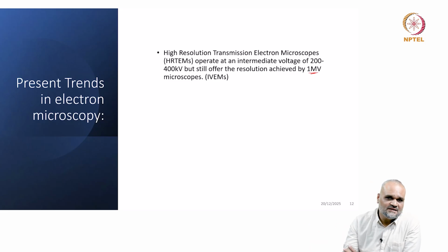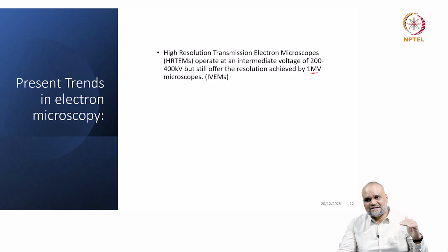So from the 1980s to 1995 or 2000s, I think around 1998 is when the first trials on aberration correctors were successful, by Harald Rose, Maximilian Haider and Knut Urban. This was done at the Forschungszentrum Jülich, breaking that 1 angstrom resolution barrier and getting aberration corrected microscopes into the market. The trend of improving on resolution kind of saturated.